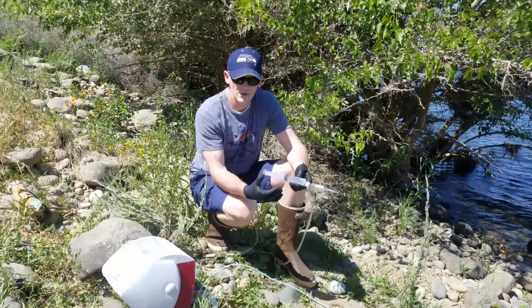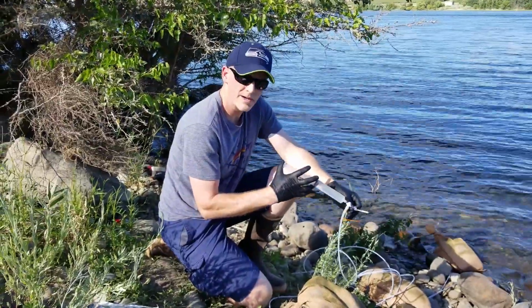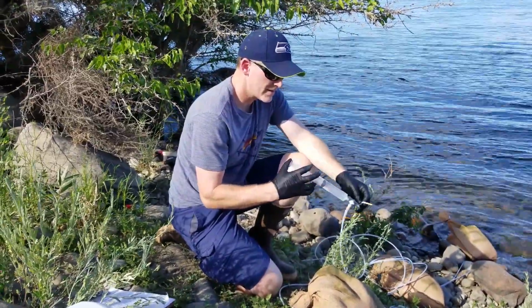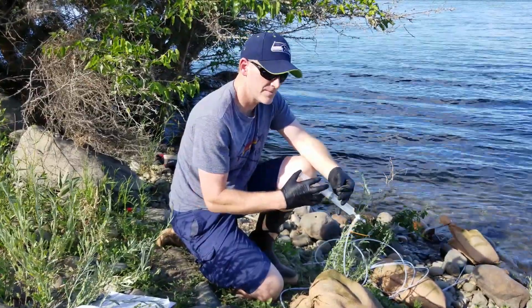That's important to make sure we're pulling pore water and not just sucking surface water down the edge of the push point. You will then squirt water after the 3rd flush. You'll squirt that onto the pH paper and take a pH measurement just as you did for the river, recording it on the hard copy data sheet.